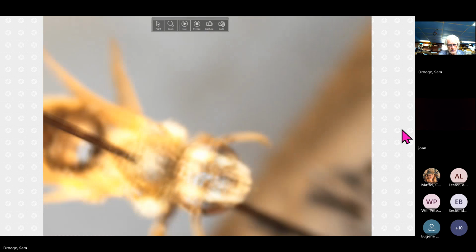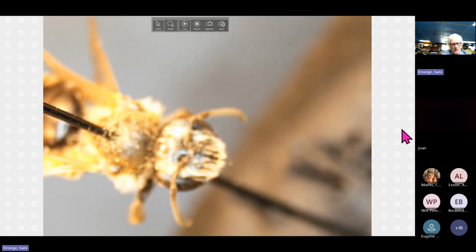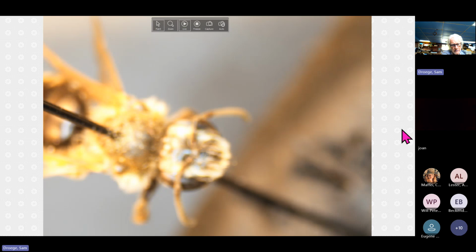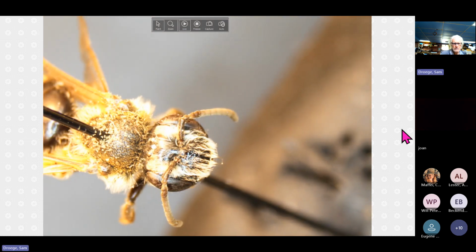All right, so we're going to zoom in on the head again from this far up. Let's see if we can really, can't quite, well, you can a little bit. So here's this bent part. So where we have the curve showing up in terms of the dark patches away from the fovea, which is highly bent at the lower part.